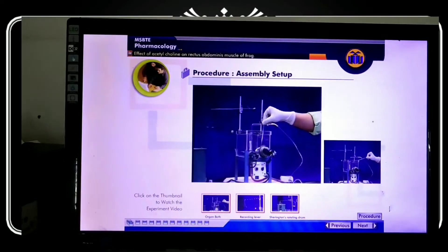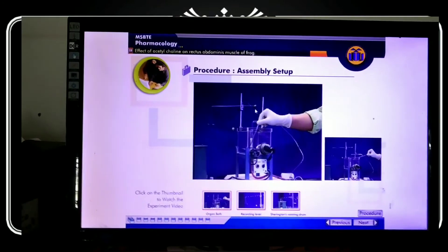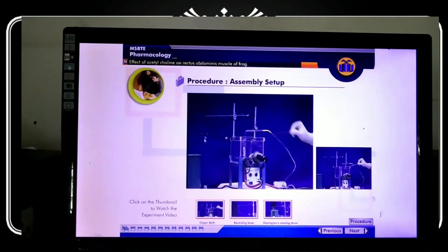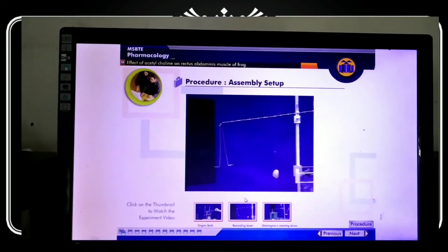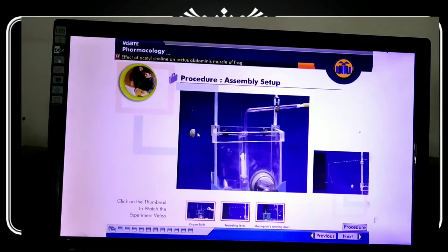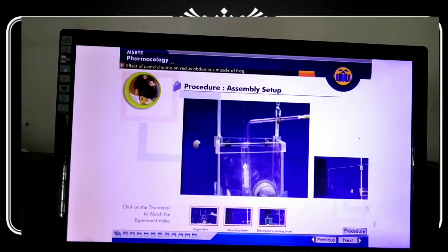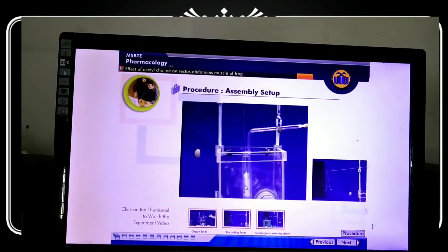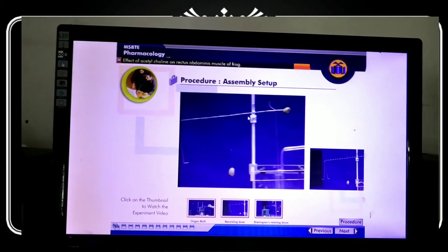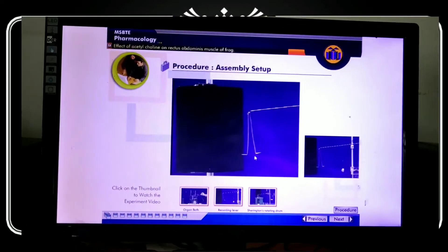This is the complete assembly — the organ bath — in which we can maintain temperature. If there is movement after the administration of the drug, it is a function of the rectus abdominis muscle. With the help of the frontal writing lever, we can record the graph of muscle movement.